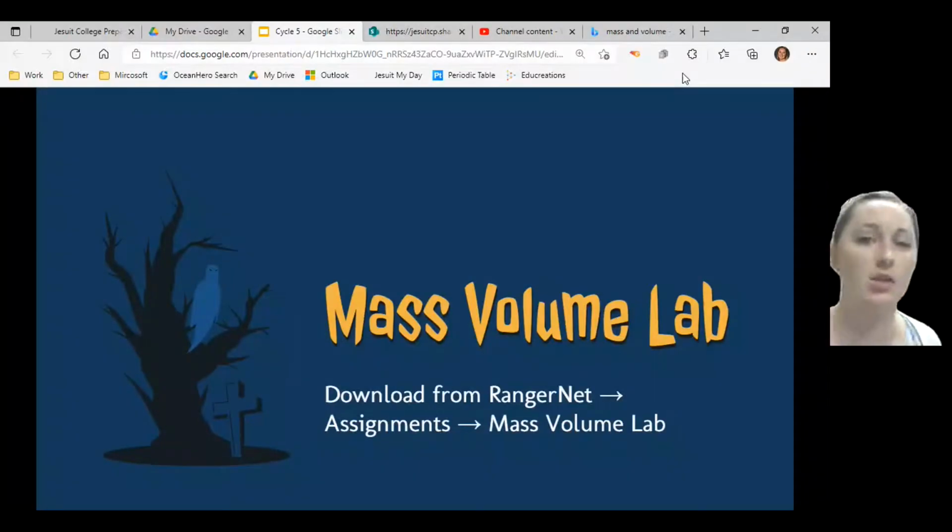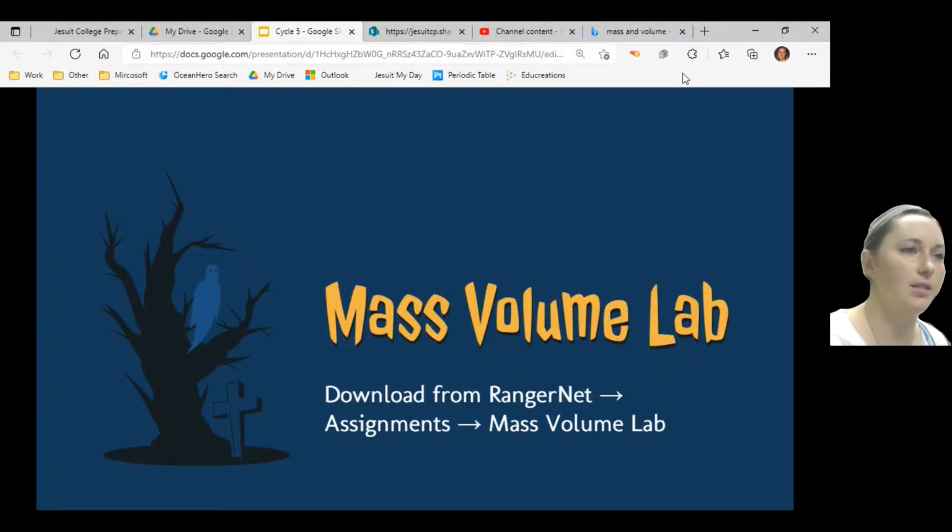All right, guys, we're going to talk about the mass volume lab just to get you started on what you need to do procedure-wise. So go to RangerNet and download this lab from the assignment center so that you have it. Remember, always put your title, tasks that you can copy down from the lab, make your prediction, and then follow your instructions from there over materials and procedures.